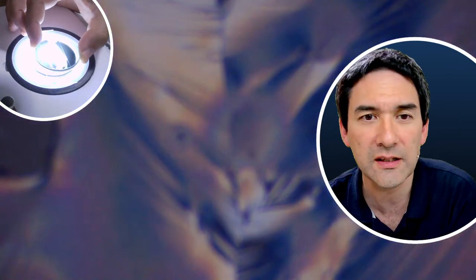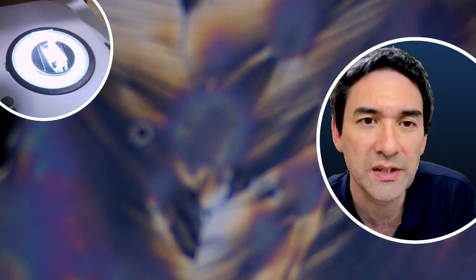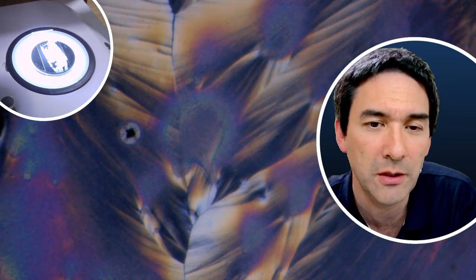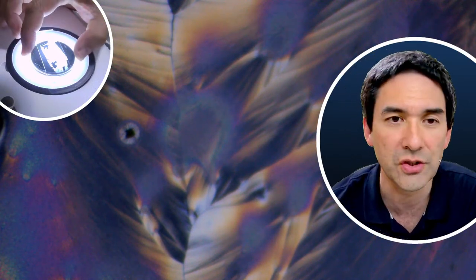Okay. I turn up the light a little bit more, and then I place the second filter over it, and then I start to turn it until the background turns black. Just drop it on here, but I have to refocus again a little bit, until I get a reasonably clear and crisp image. And then what you're able to see is pretty beautiful colors.